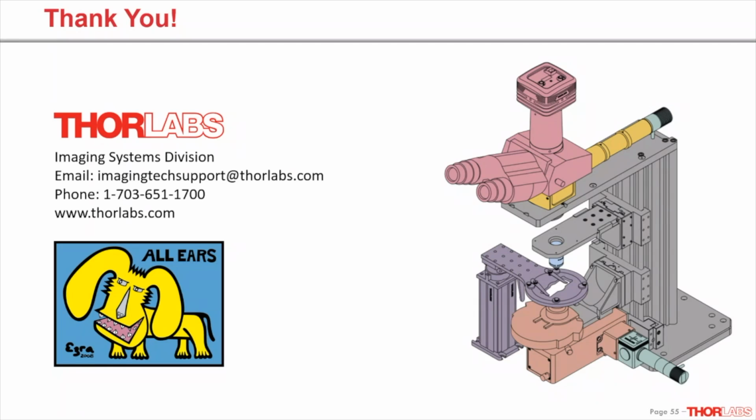I'm assuming the fiber is fairly thick. You can definitely image fibers with Brightfield imaging, and if you stop down the aperture diaphragm, you can achieve a really long depth of field. So yes, you could definitely image a fiber without one of the other contrast enhancing techniques we have, just with straight Kohler illumination and a properly adjusted condenser.